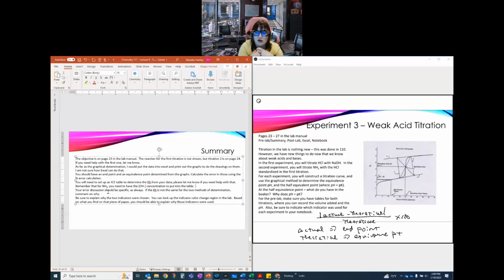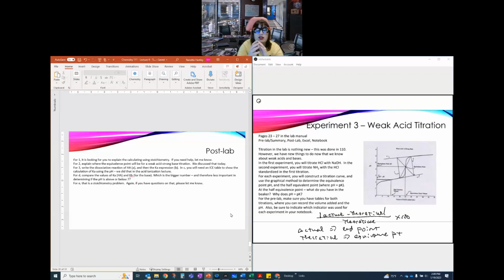So there is an indicator color chart that exists in the laboratory. For you guys in the online class, you can look at the 2 indicators and see where they do their color change. That's based on their pKa or pKb. So go look at that to see where we're talking about and why we would have chosen those particular ones. Now remember, we're probably going to be choosing that based on the fact that endpoint is going to be past the equivalence point that we're looking at for the titration in question. Okay, so that's everything that I want to talk about for that.